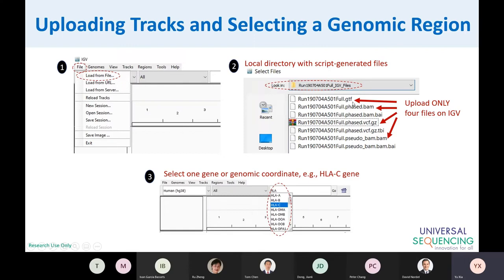And if we enlarge this portion, you will see something like this. So this G is linked to this A, linked to this reference, this reference linked to this C. And then this shows the detail in the read BAM track.